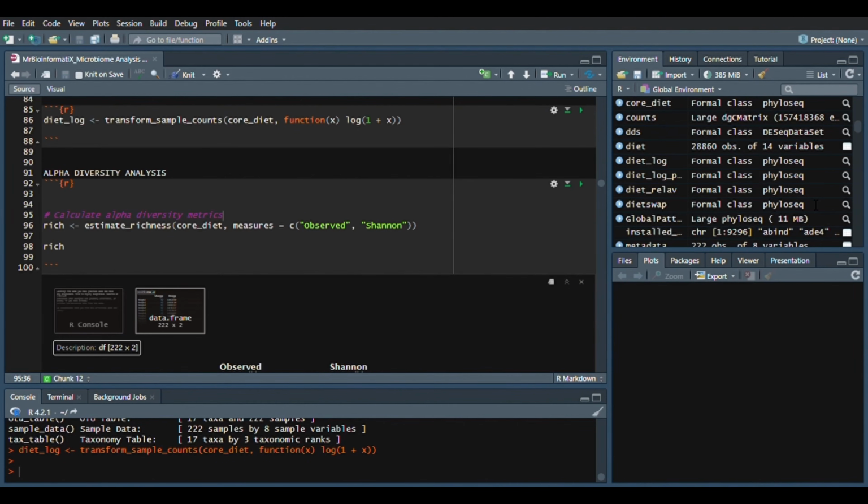For example, imagine you have a single garden with various types of flowers. The flowers are 10 roses, 5 tulips, 5 daisies, and 1 sunflower. Regarding the richness, there are 4 different species, which are roses, tulips, daisies, and sunflowers.